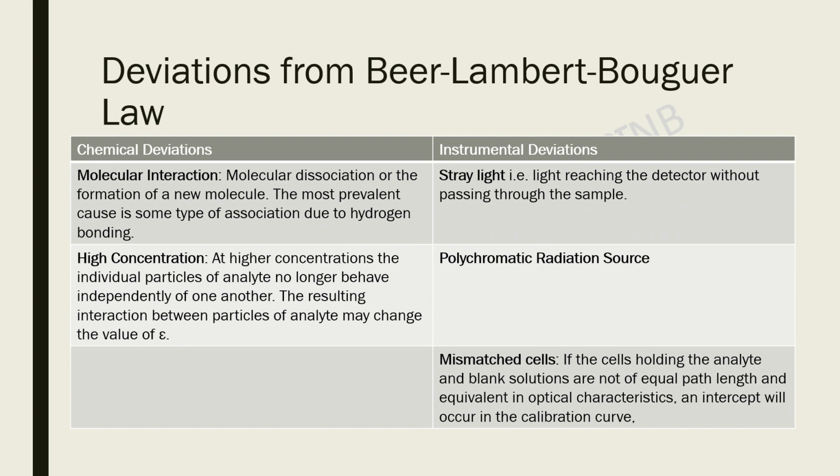This will lead to the stray light effect, so it is avoided. The compartment is made completely black, to avoid absorption of any other kind of radiation.